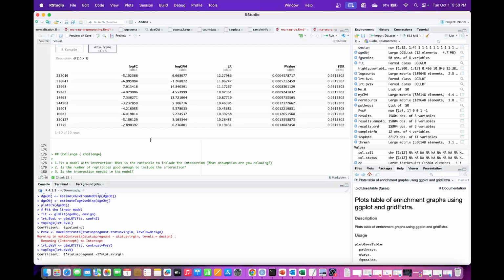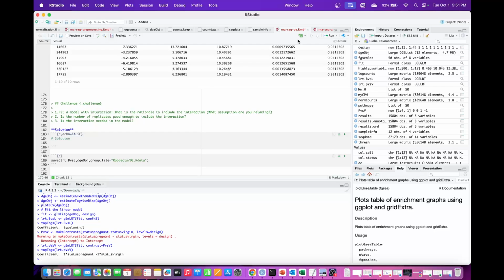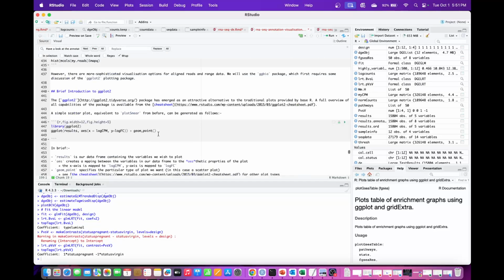After this, what we'll do is the functional enrichment analysis. First we started with counts data. We did QC on that. We set up the data, meaning we did counts per million, we did log2 transformation, we cleaned up the data. Then we checked for differential expression analysis, and we got different types of models for that, GLM and LRT, and we checked log fold change, p-values, and FDRs. Now the next part is the functional enrichment analysis.